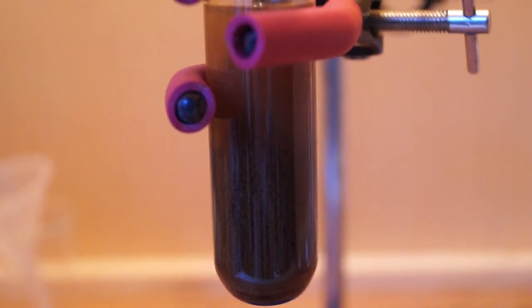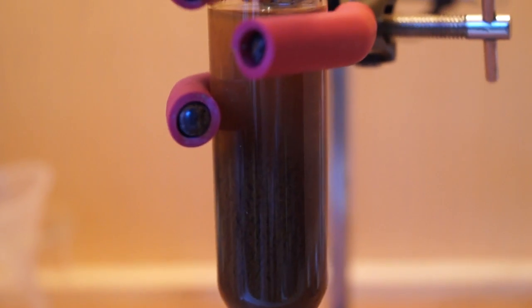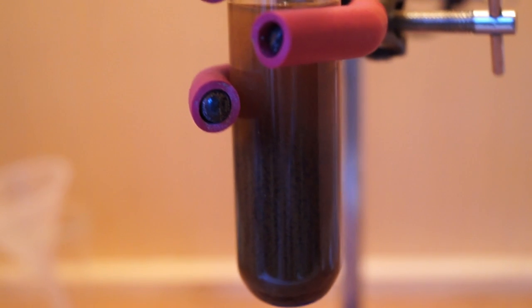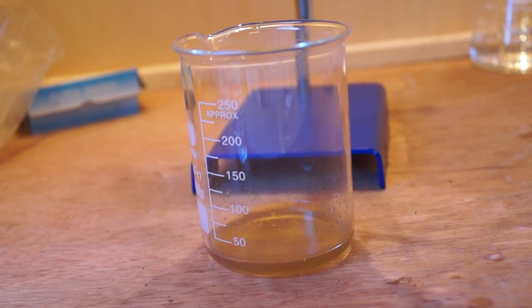After leaving the reaction for a while, I returned to see that the mixture had turned brown. I then proceeded to filter the liquid from the excess potassium permanganate that had not reacted. I was left with a yellow-brown colored mixture.